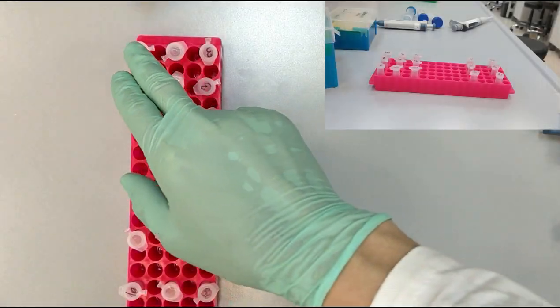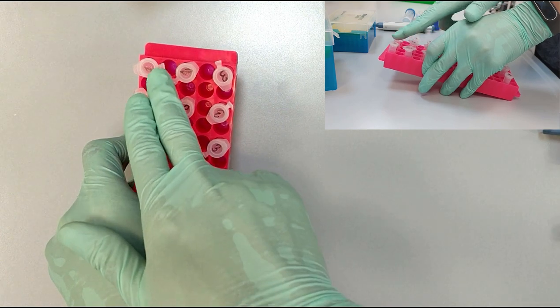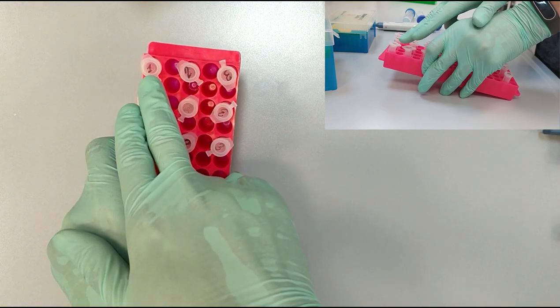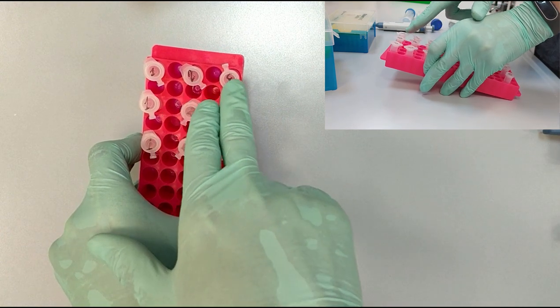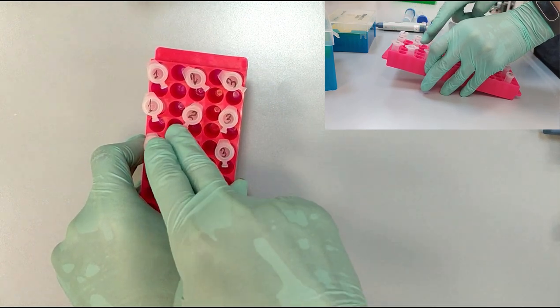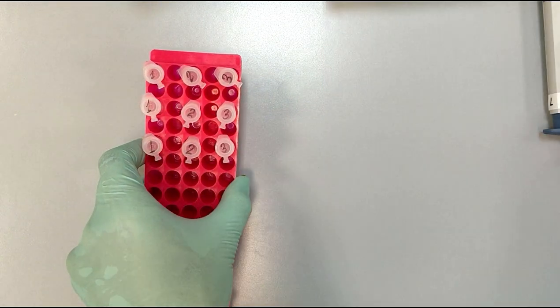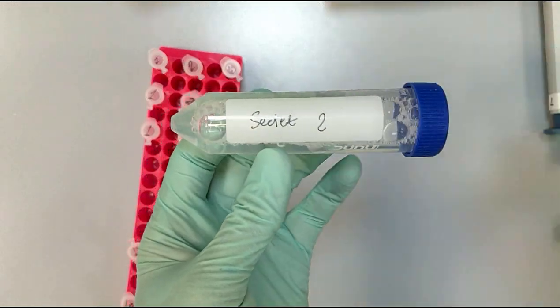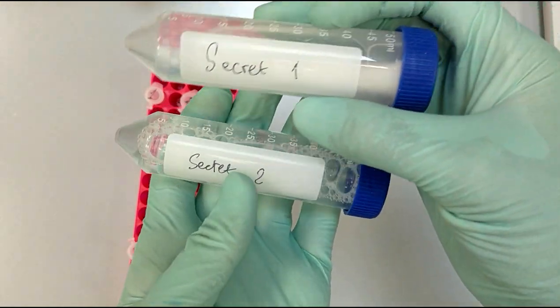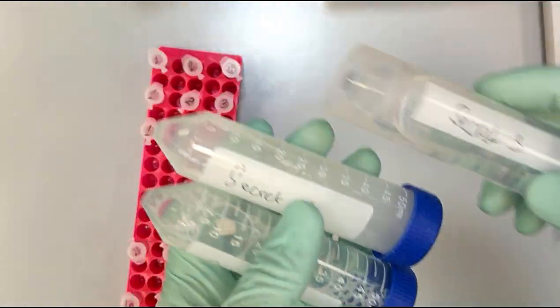We have three sets of eppendorf tubes for secret solution 1, secret solution 2, and secret solution 3. We have three sets, and we are going to transfer one milliliter of these secret solutions to the corresponding eppendorf tubes.